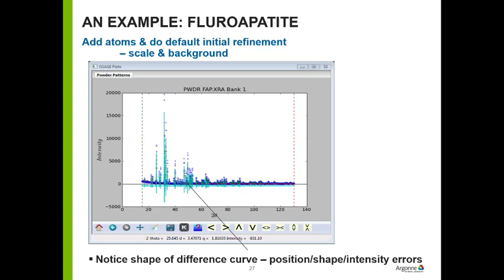So he was interested in that, and so he collected this data on his laboratory diffractometer back in the middle 70s, and it has lived on as a Rietveld refinement example ever since. It's been refined thousands of times by thousands of students, both for GSAS, GSAS-II, and its predecessors.